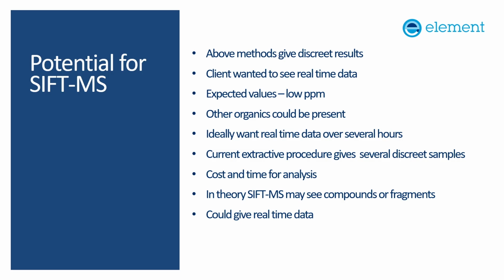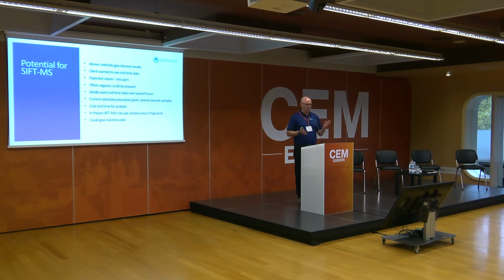And a client or several clients that we were working with wanted to know if there was any possibility to see real-time data. As it says up there, they expected some low values, low ppm, even ppb levels. They did have some other organics there, but it was a limited suite. And they ideally wanted this real-time data over several hours. So they wanted to see what was going on in the process.